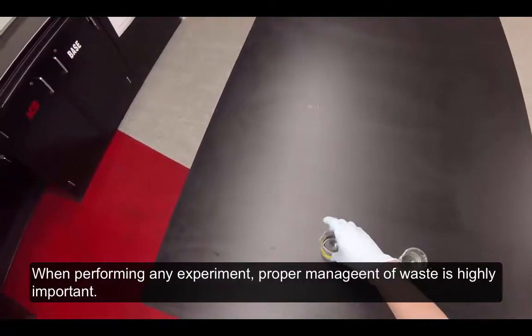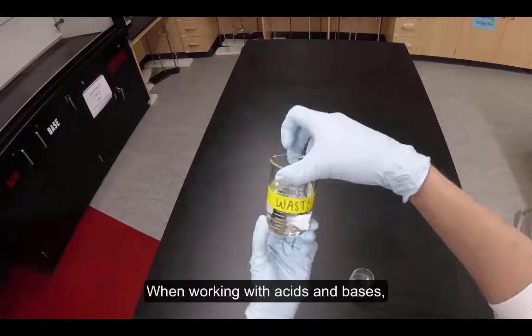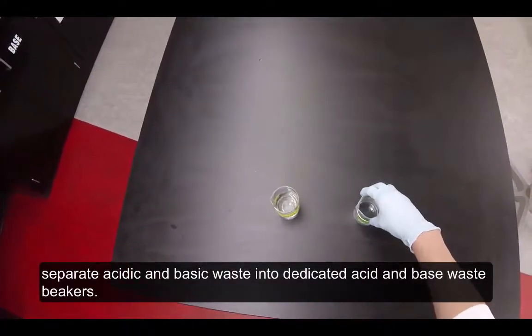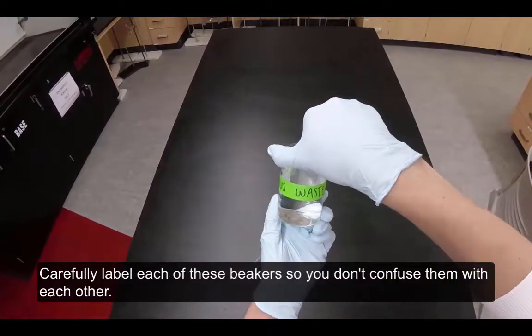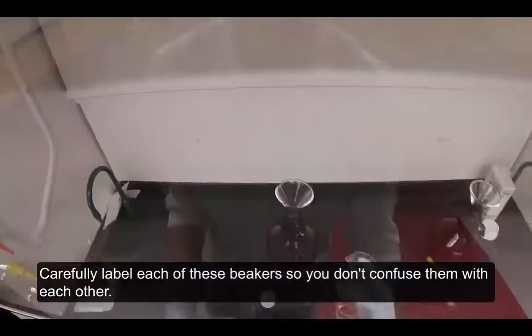When performing any experiment, proper management of waste is highly important. When working with acids and bases, separate acidic and basic waste into dedicated acid and base waste beakers. Carefully label each of these beakers so you don't confuse them with each other.